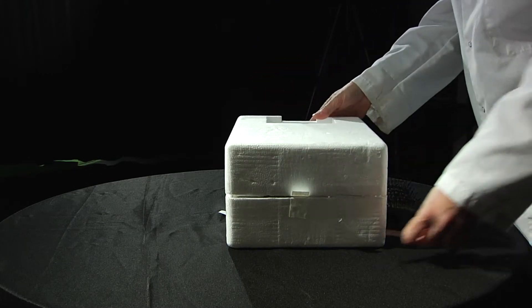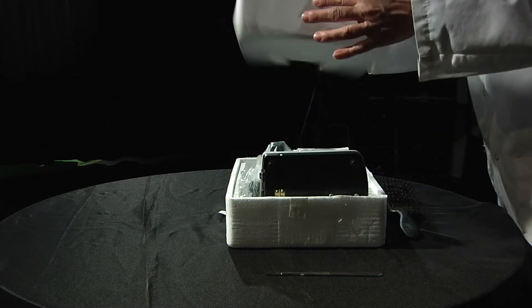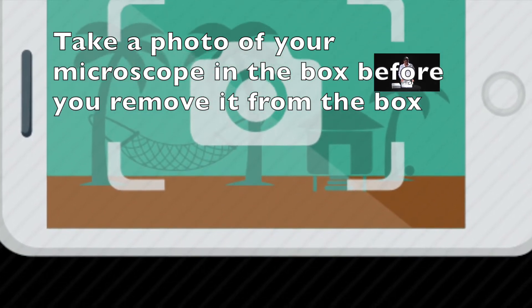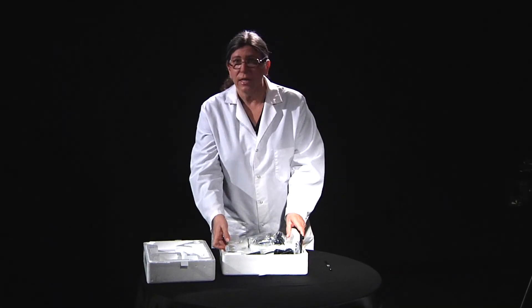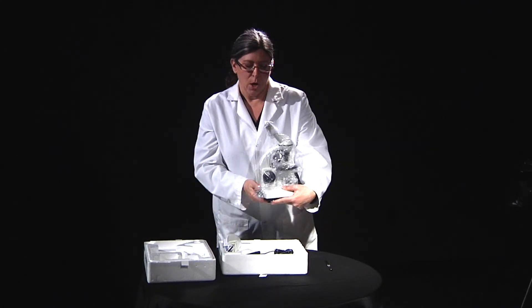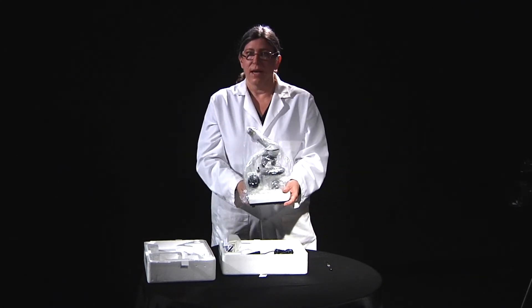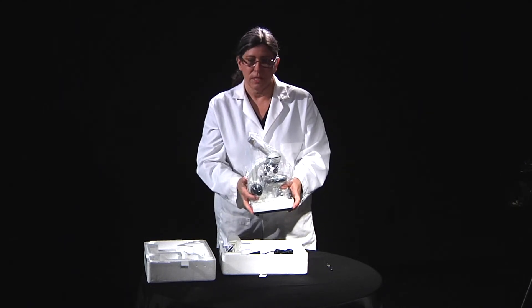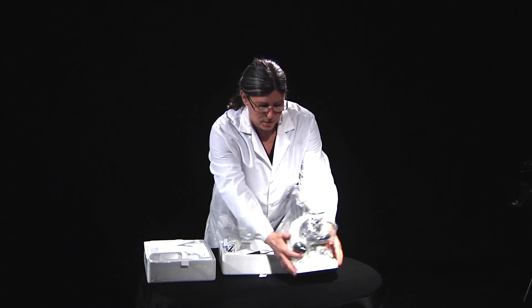When you're done with that, take the lid off and put it to the side. In this kit there is the microscope, and very likely the microscope will be in some plastic. Make sure that you hold the microscope with two hands at all times as much as possible.